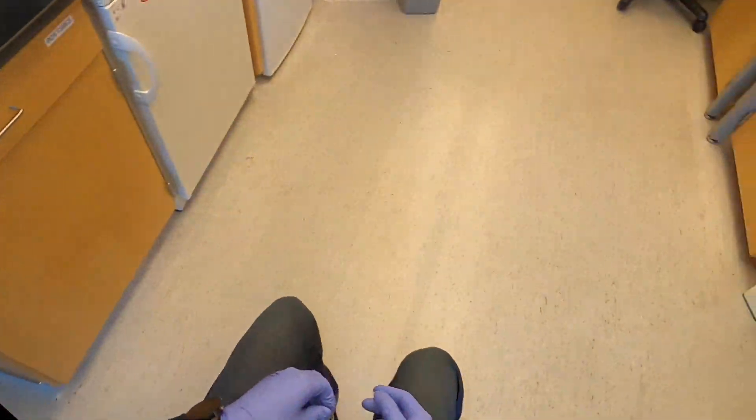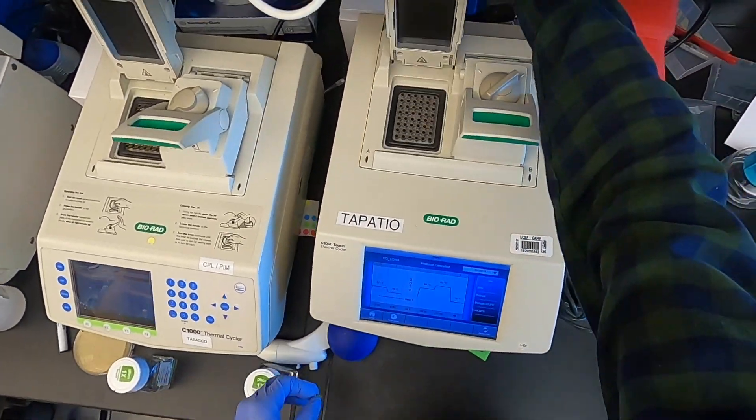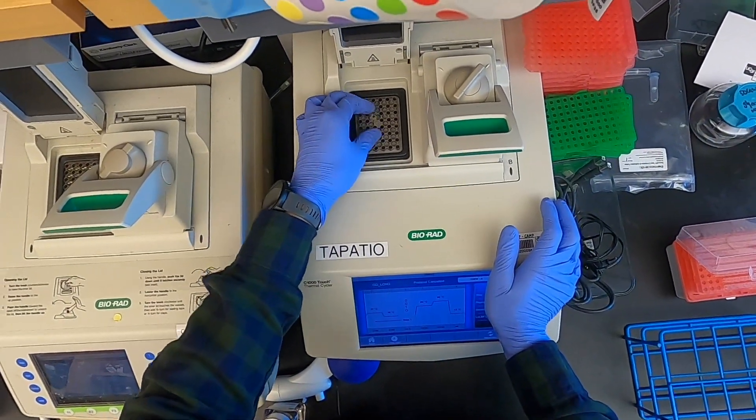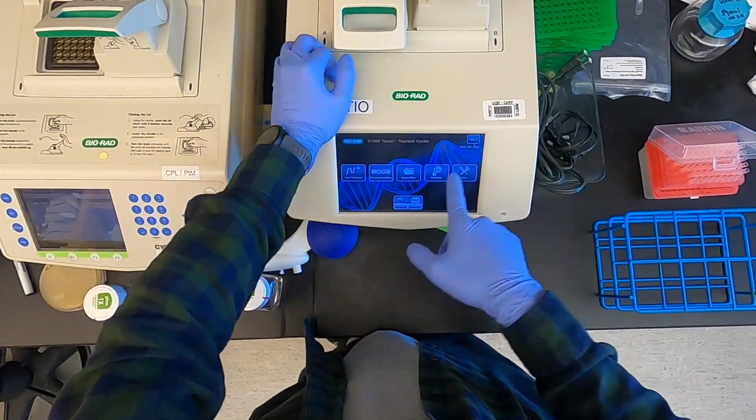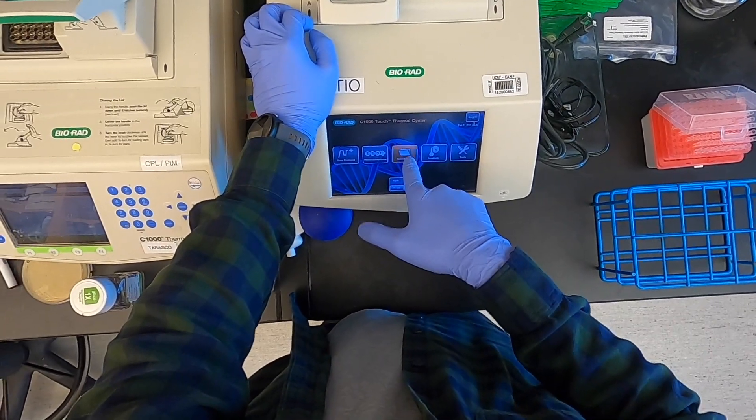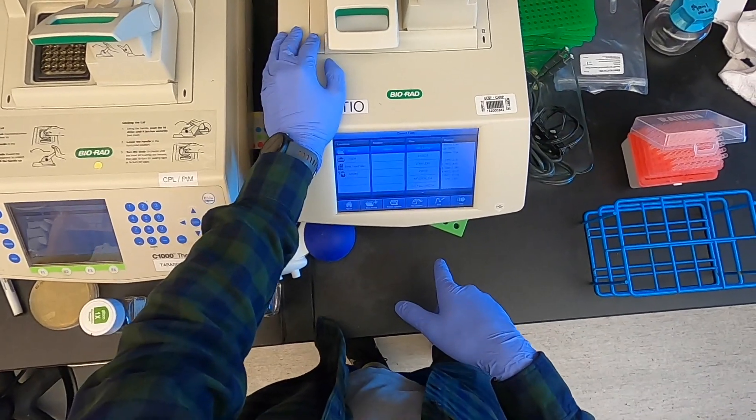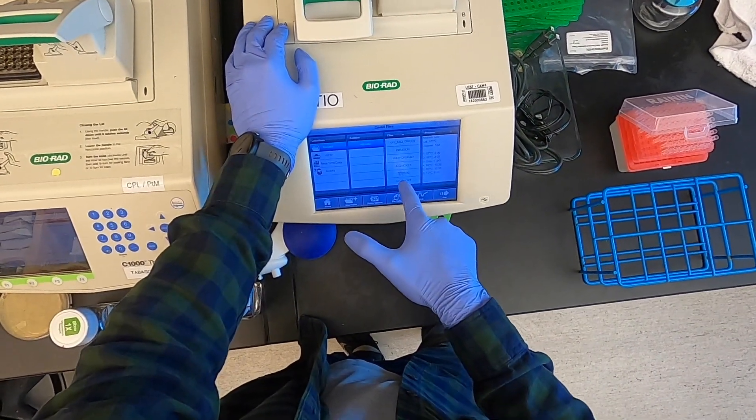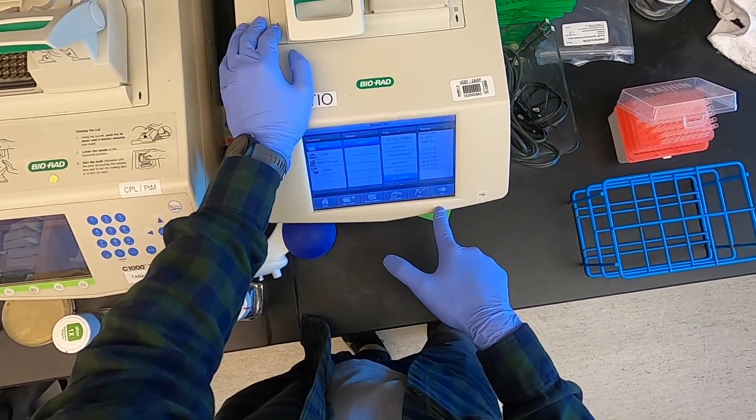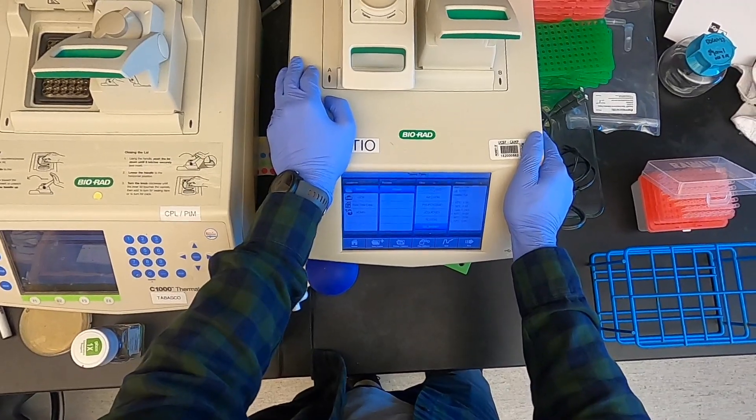And then I'm going to take this tube over to the thermocycler. 64. Today, since I am on a time crunch, I am going to run the GG short protocol, which takes about an hour. If I had more time, I would run GG long, which takes about three hours to complete but gives you slightly higher efficiency.